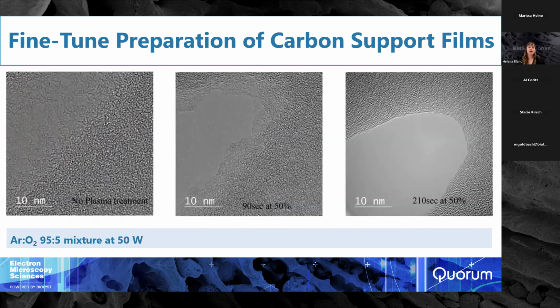I mentioned that we can fine-tune preparation of carbon support films. When we are using TEM grids, we can either coat them ourselves or we can buy pre-coated TEM grids.